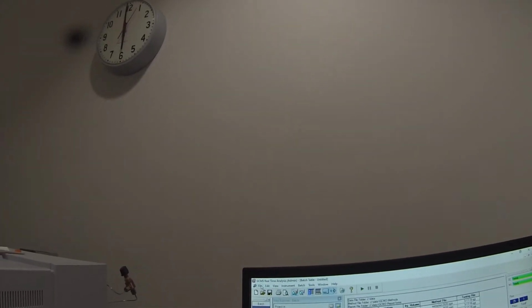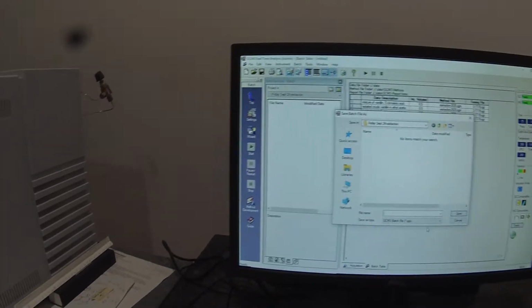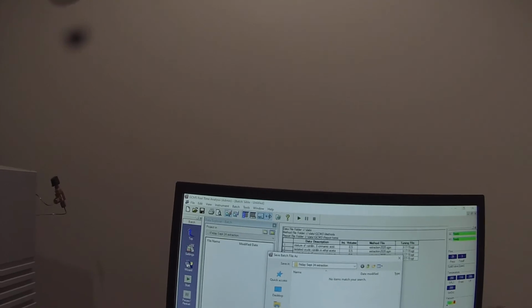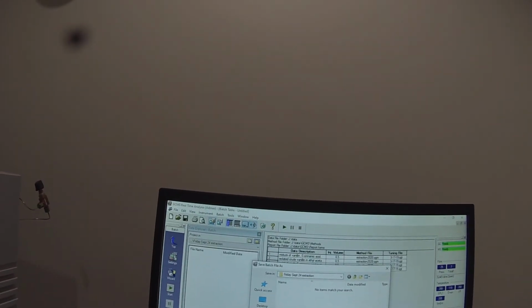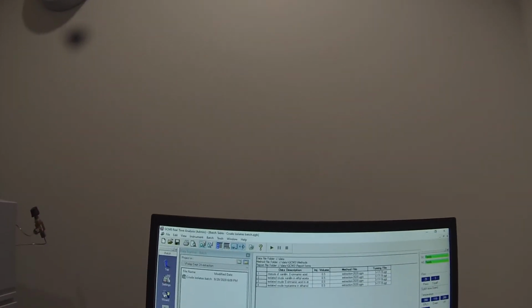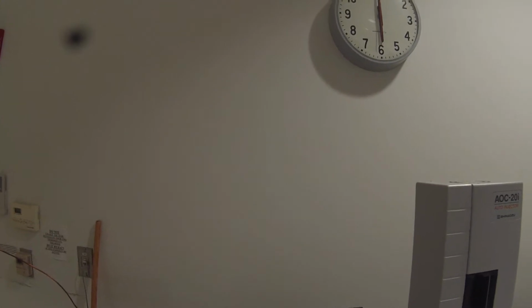And I'm going to save this batch file as crude isolate batch. So that's my batch file all set up. I'm just going to check and make sure that I put them in the order I said I did. So vanillin should be in 2, cinnamic acid in 3, tryptamine in 4, the mixture in 1. That all looks good.